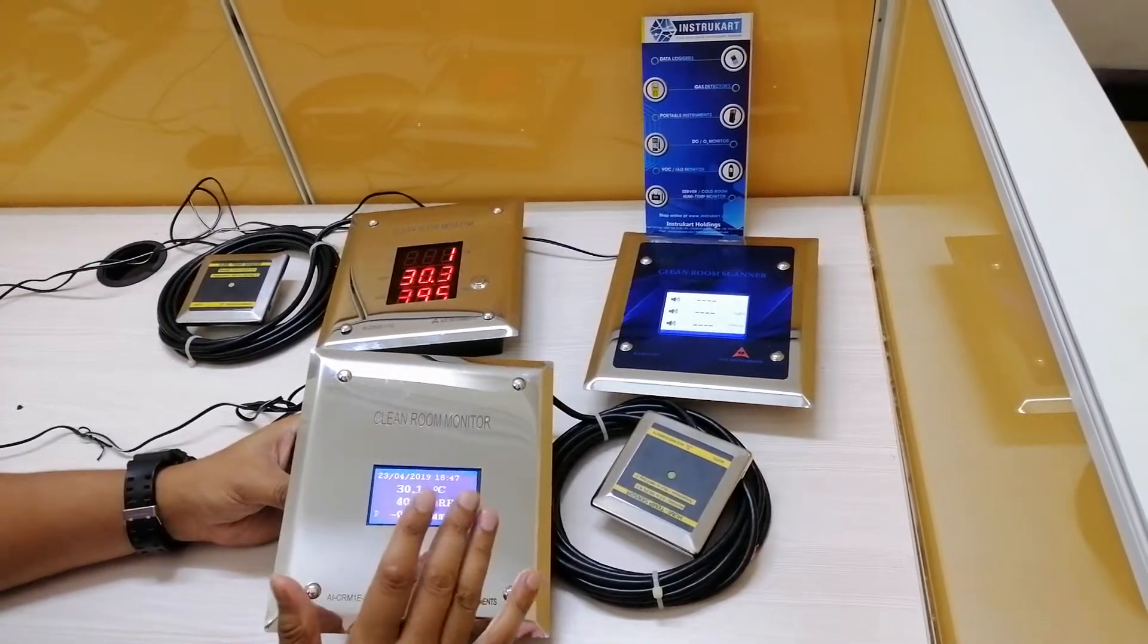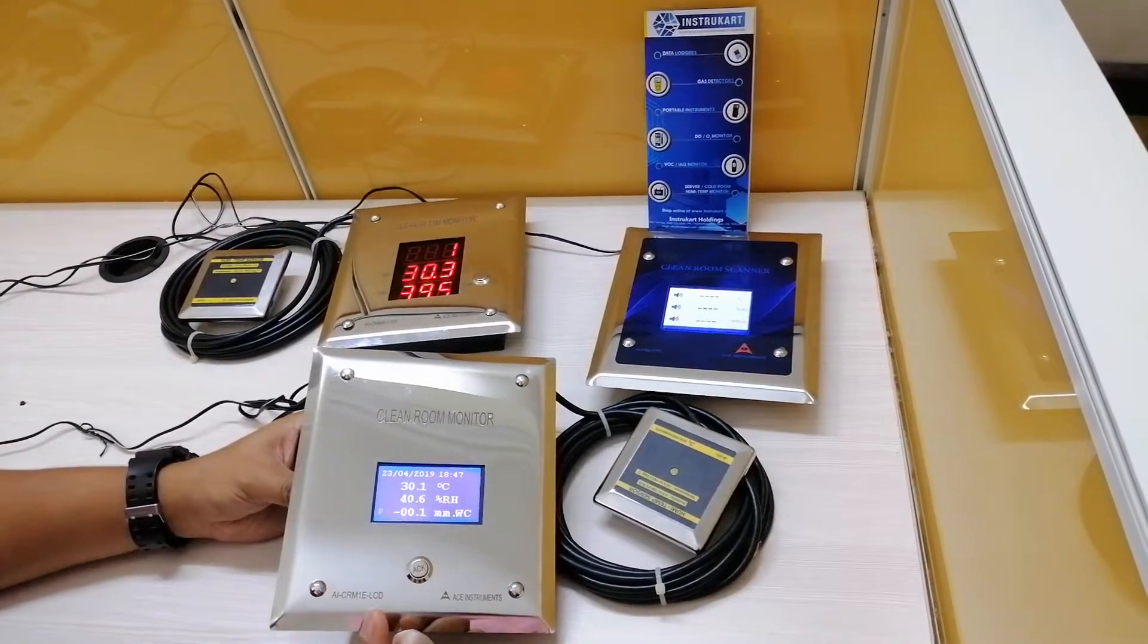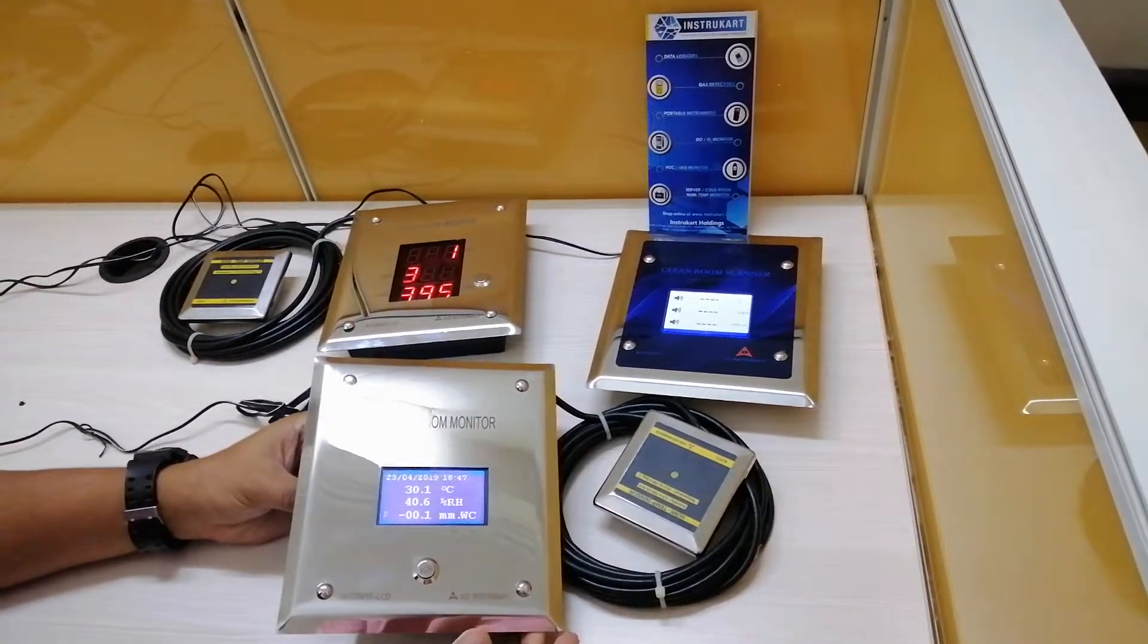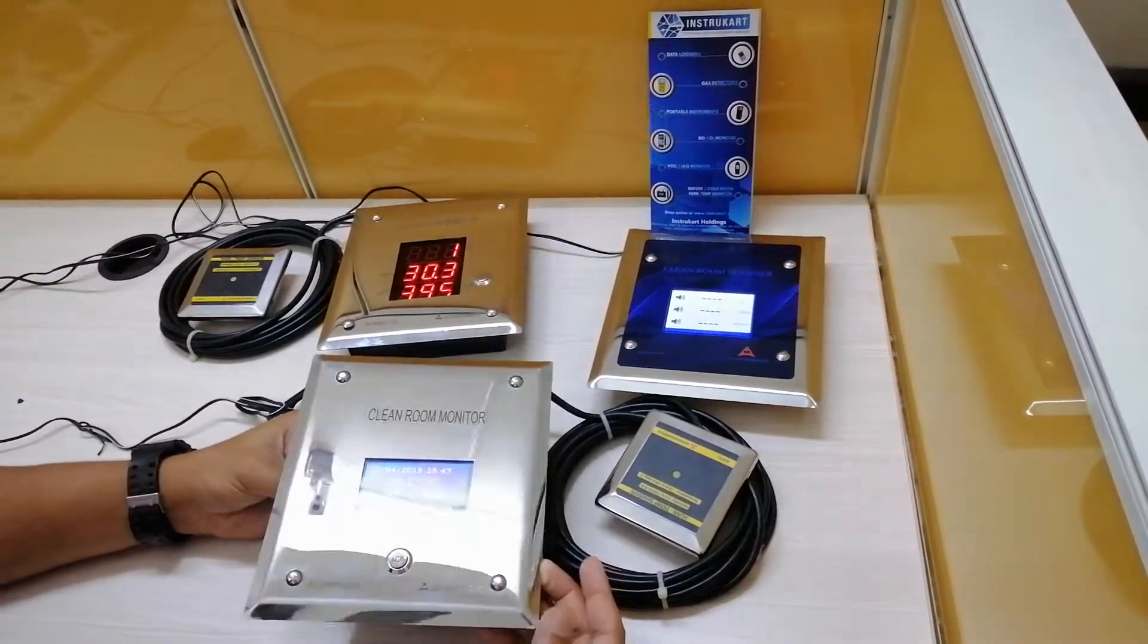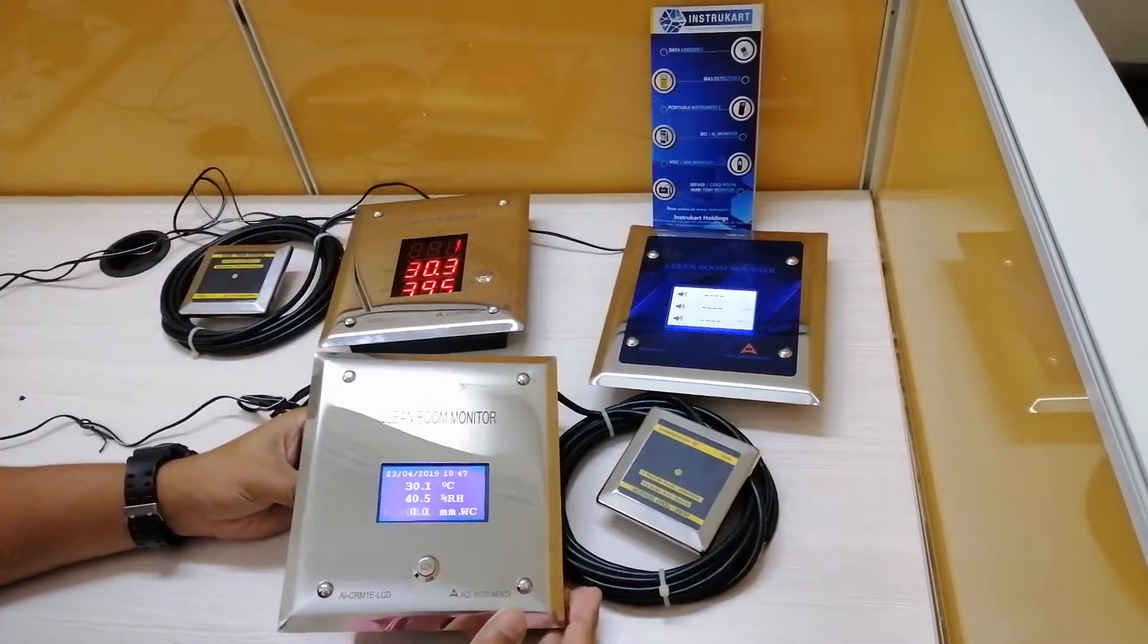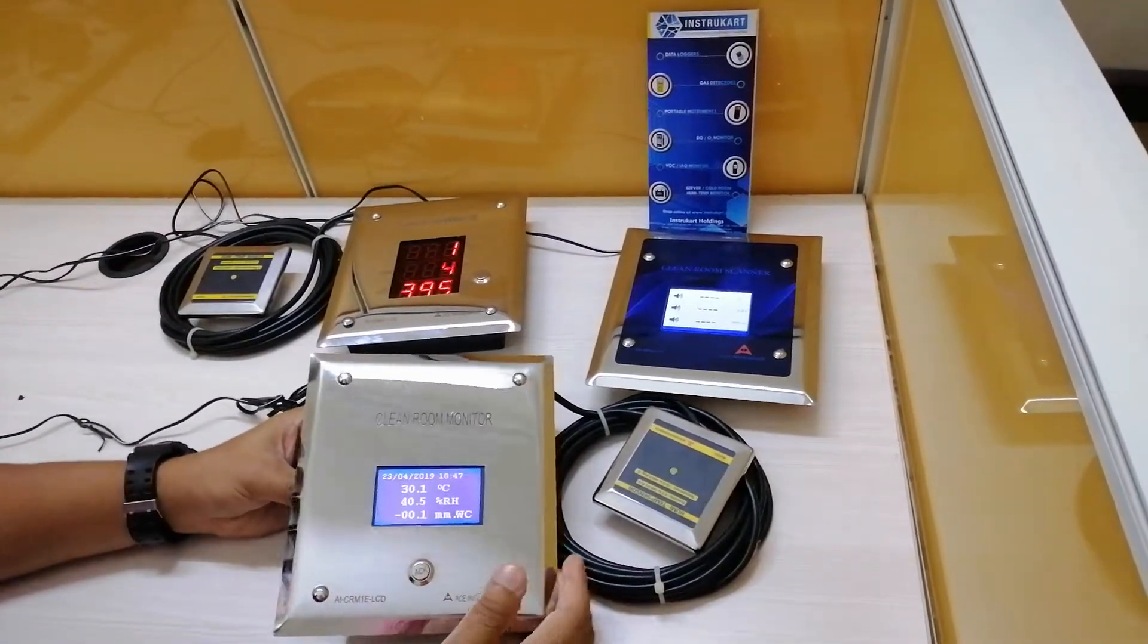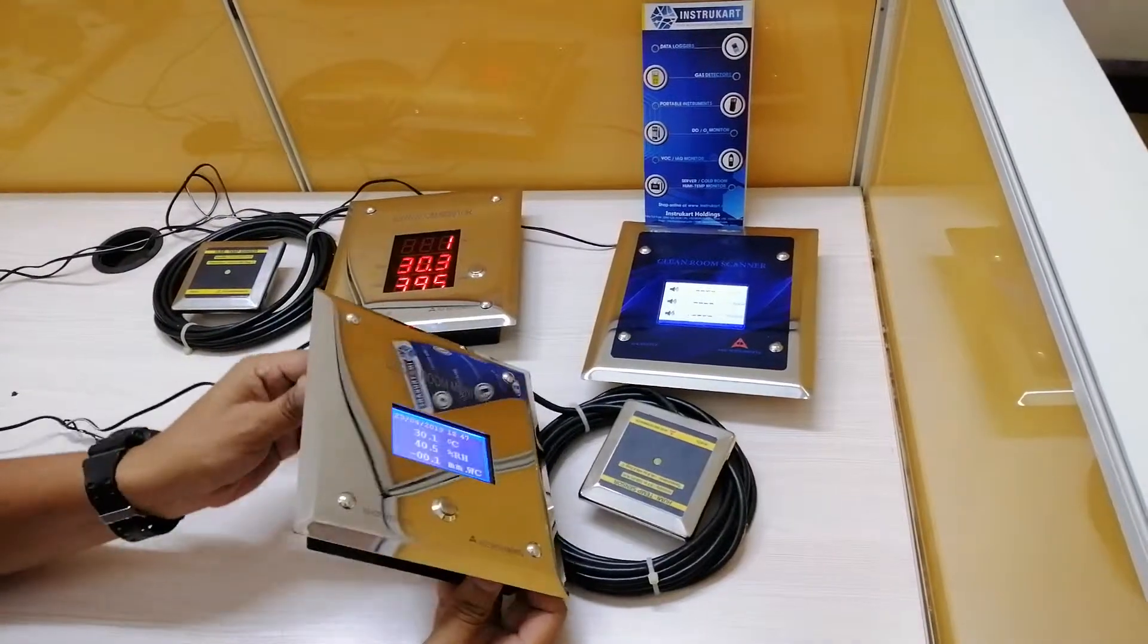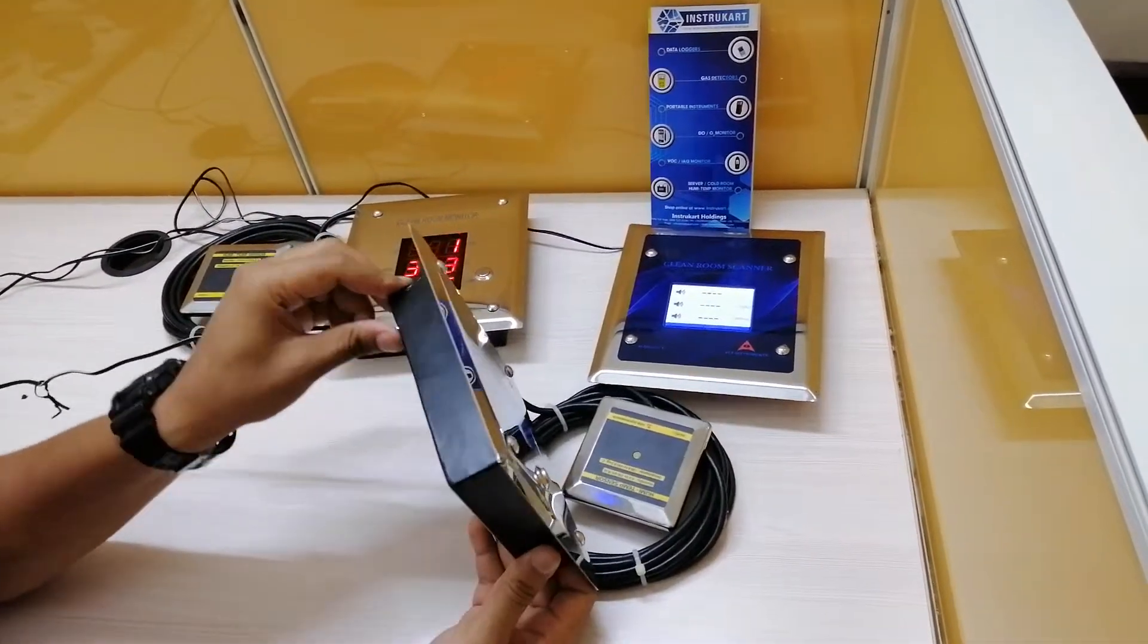Coming to the hardware, it has a front stainless steel plate which is well fitted to the panel, with a provision for mounting. The back is MS powder coated.